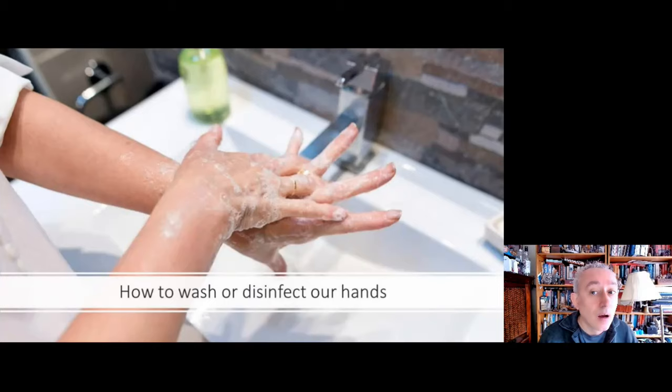Then we're going to switch over and we're going to do the reverse, so we're really getting into those fingers. Then we're going to take the thumbs and we're going to twist the thumbs on both hands, really getting that sanitizer into it. Then we just need to make sure that we've really got into the palms with the remaining sanitizer and then we conclude with the application. If it's not enough sanitizer, if you find that's drying out, then you need to do an additional application. But that's the kind of standard medical grade hand sanitization technique.